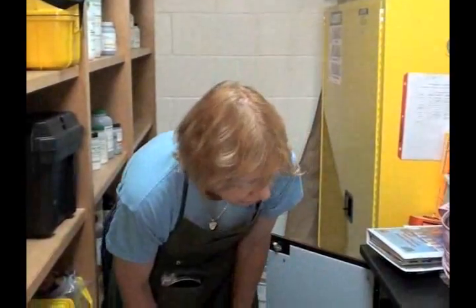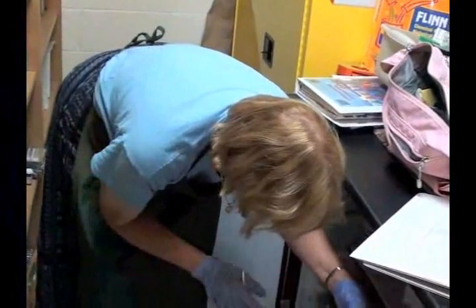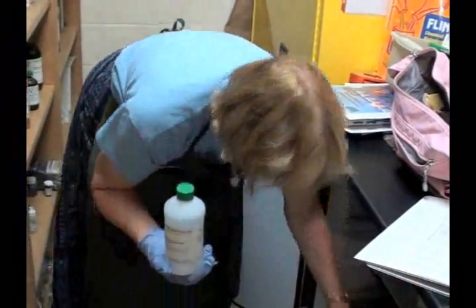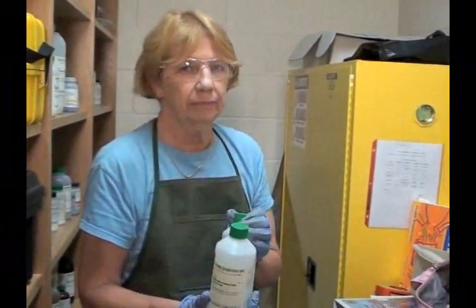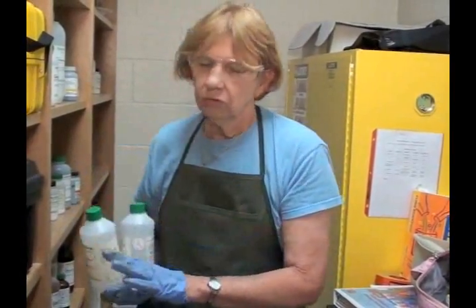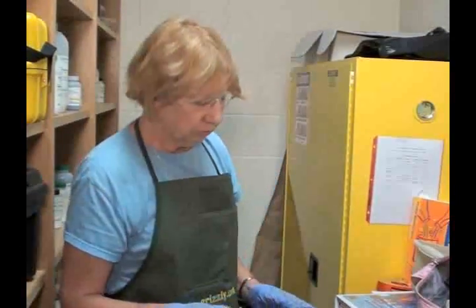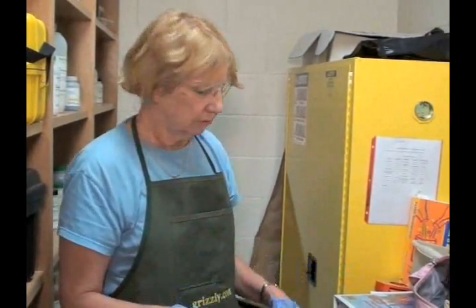But here again, you just need to go through each little bottle and container and put it on your sheet. Here he has sodium hydroxide stored in with the acids, which probably isn't a good idea. So it would be better if you have a corrosive cabinet that's dedicated to basic solutions. You should store them in general storage, not in the acid cabinet where they might react. Sometimes you'll see how that happens when you store ammonium hydroxide and hydrochloric acid in the same cabinet.